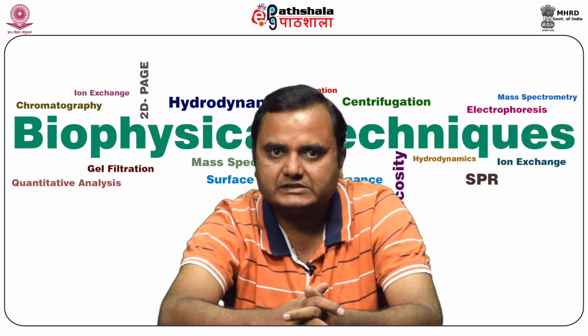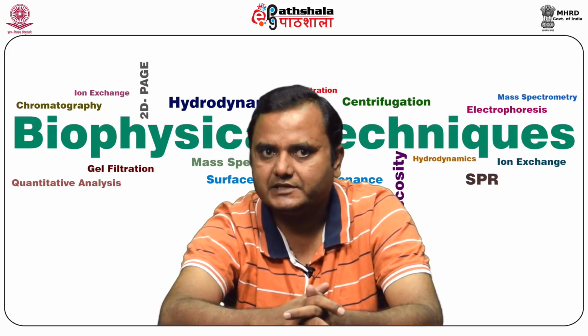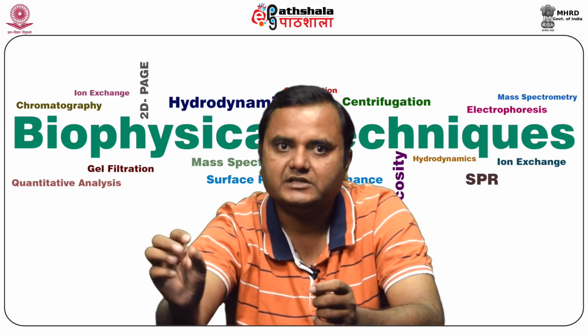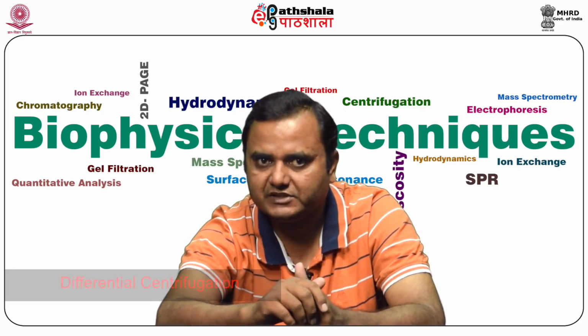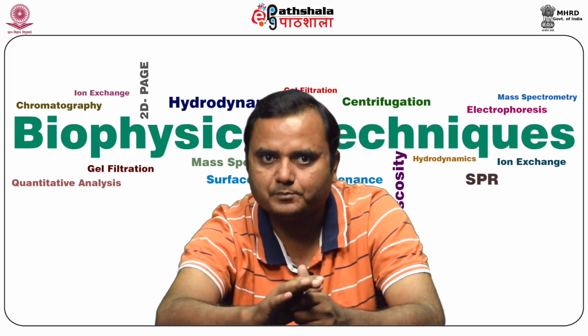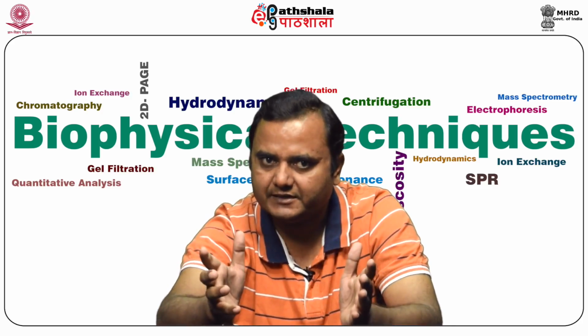Centrifugation is classified into mainly two groups: differential centrifugation and density gradient centrifugation. In differential centrifugation, the cell-free extract and supernatant are centrifuged at progressively higher speeds for longer times to get them separated.